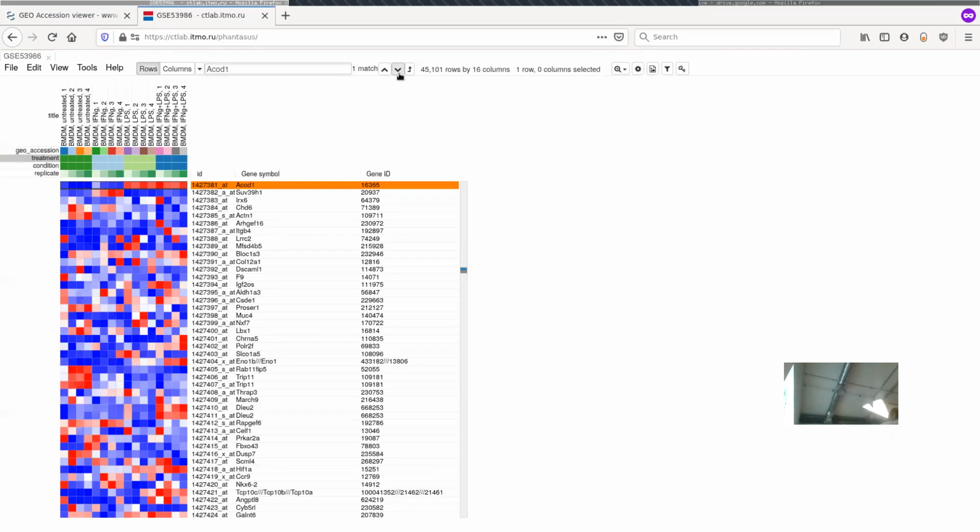And you will see that it's clearly upregulated in LPS and interferon gamma plus LPS. It's red here on the right and blue on the left. If you look closer, you will see that, by the pretty big numbers here, there are also non-zero numbers in the interferon gamma case, but mostly, relatively speaking, zero numbers in the untreated samples.